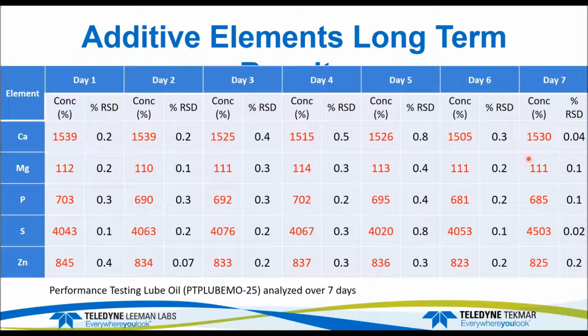One of the interests of this particular application was reproducibility from day to day. So every time we made up new standards and new preparations every day. Then we did analysis day to day over 7 days and summed it all up. If you look across, you can see the analysis is quite close day to day, and that's a feature of the sample introduction system and the ability to take the torch out and put it back in the same spot, and we'll see that in a second.